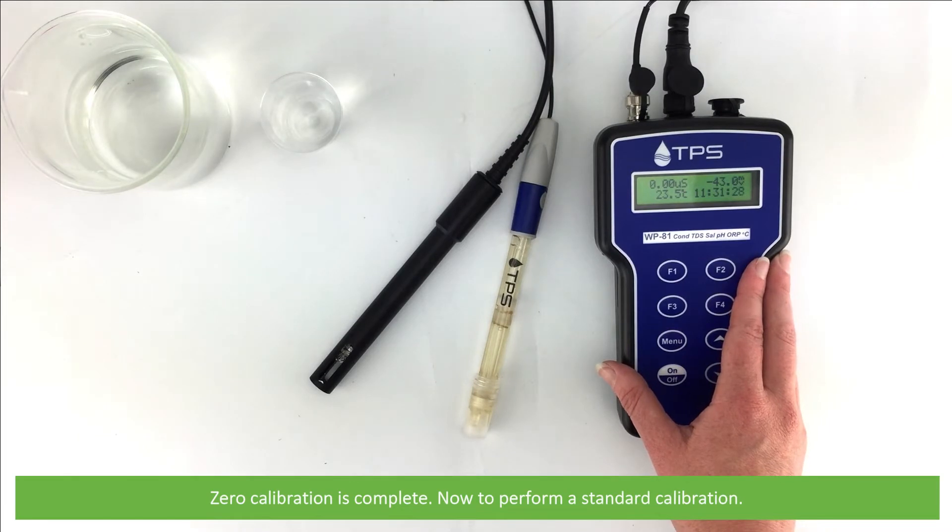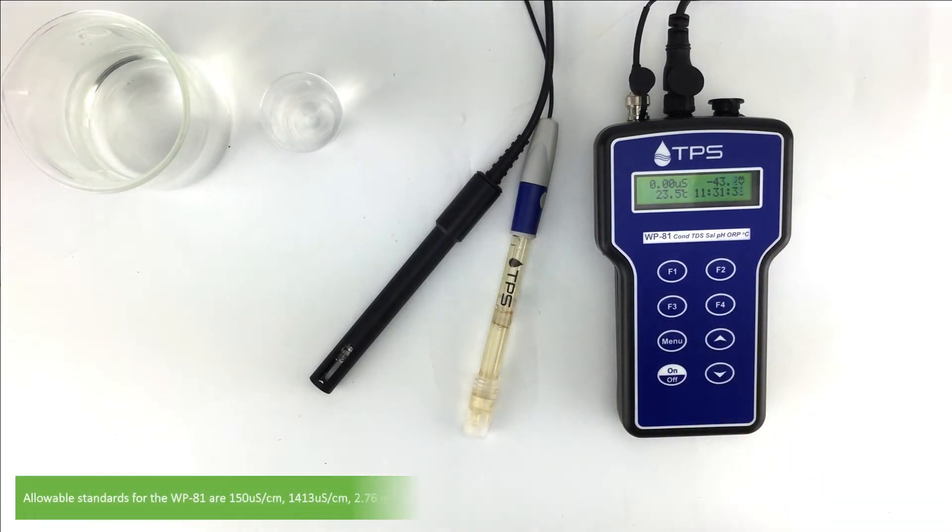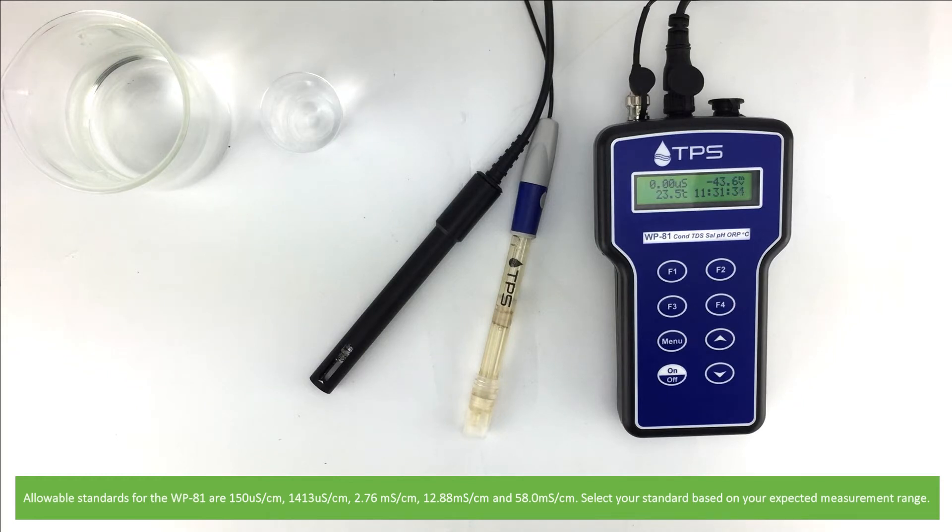Now to perform a standard calibration. Allowable standards for the WP81 are 150 or 1413 microsiemens per centimeter and 2.76, 12.88, and 58 millisiemens per centimeter. Select your standard based on your expected measurement range.